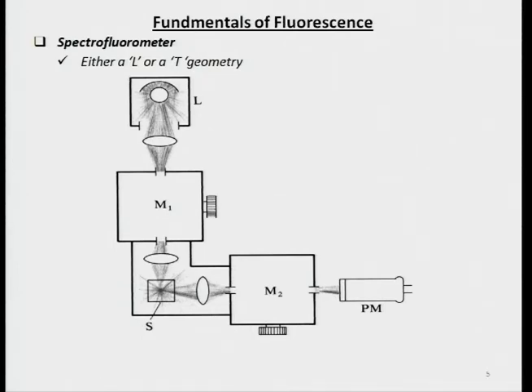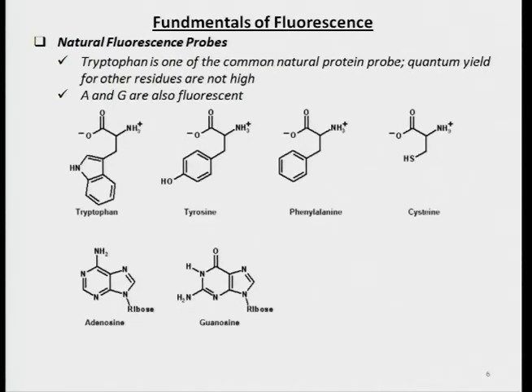So you can actually change the selection of the wavelength either on the monochromator excitation side or the emission side, and detect all different wavelengths, which gives you those broad profiles. Now, for most purposes, if you compare with NMR, fluorescence might actually sound like not a good technique. NMR gives much sharper peaks, but fluorescence has its own advantages.